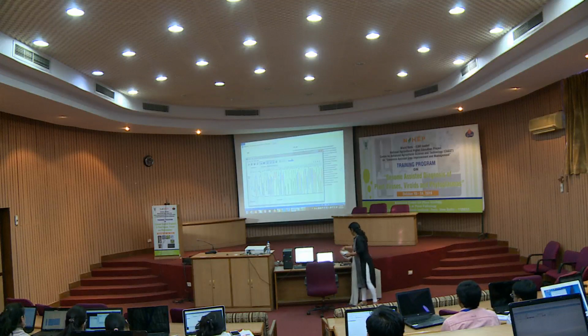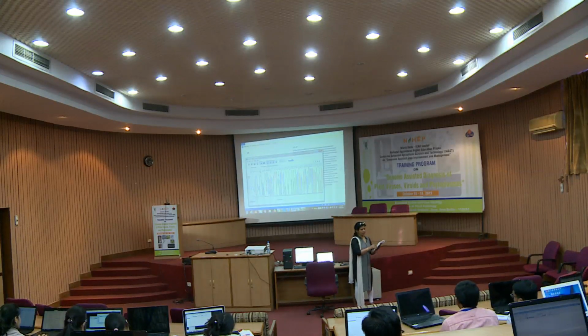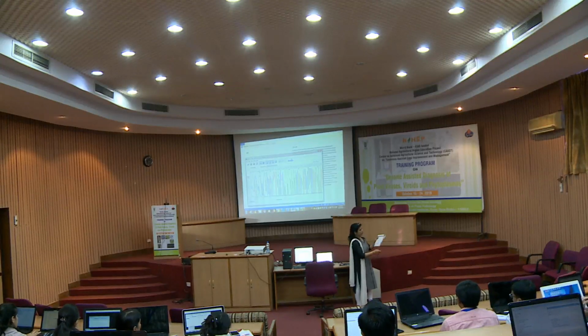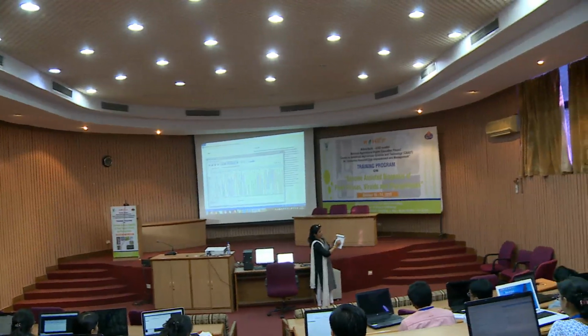Suppose these two sequences I had taken, this forward and this reverse.